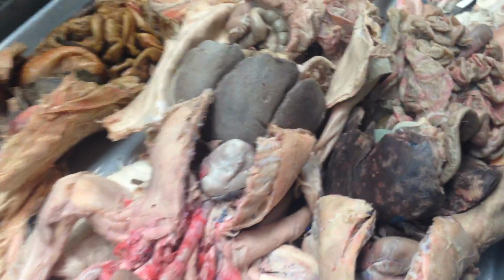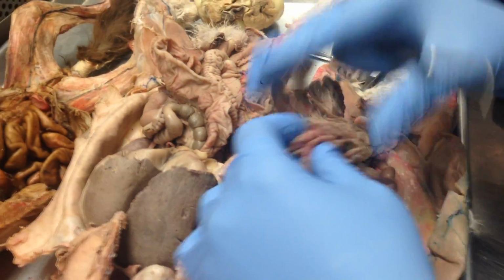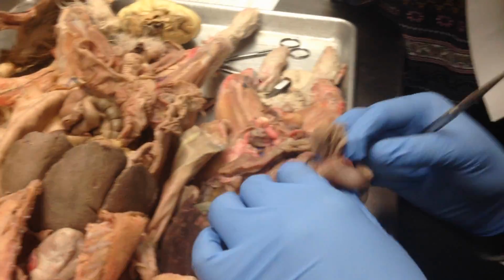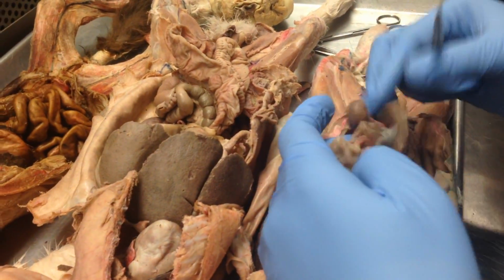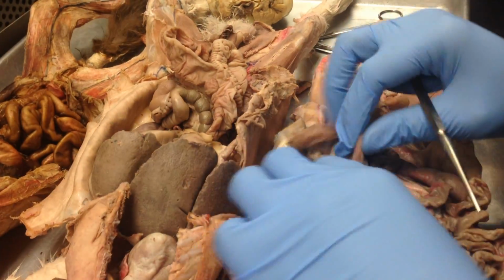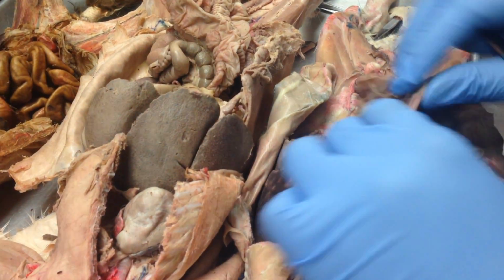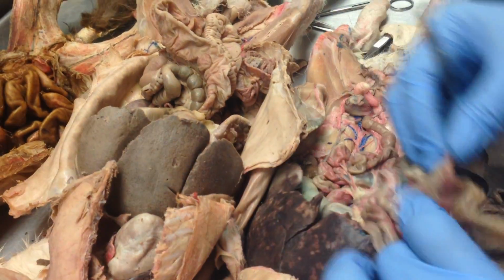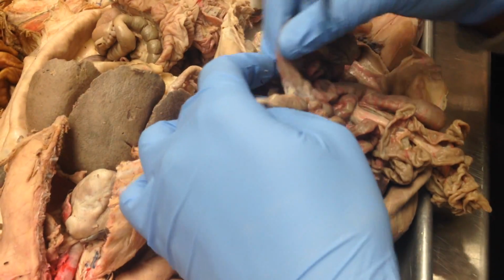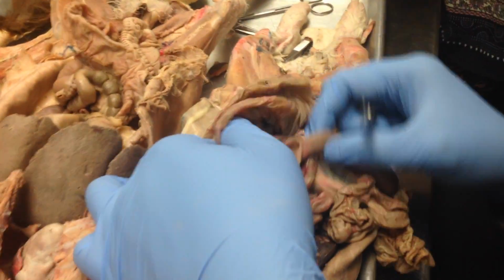The jejunum is the middle of the small intestine. All right, and then the ileum. The ileum is the end of the small intestine. Once you find the cecum, you know. There's the cecum, right here. It's the colon, so it will be on the other side, the ending of the small intestine.